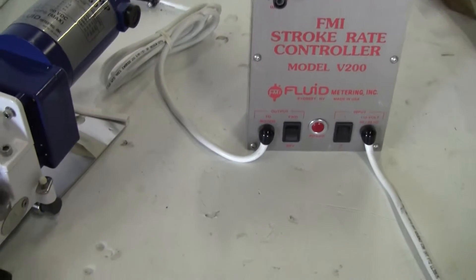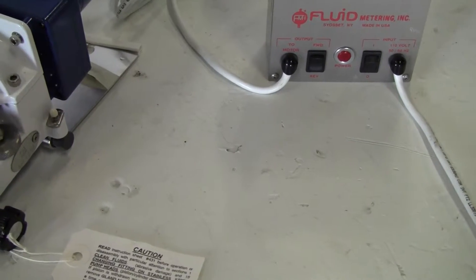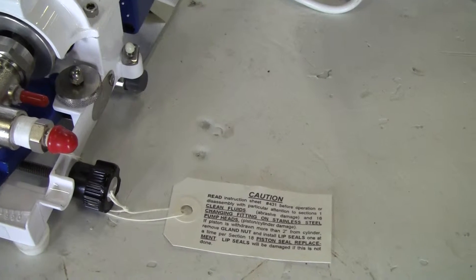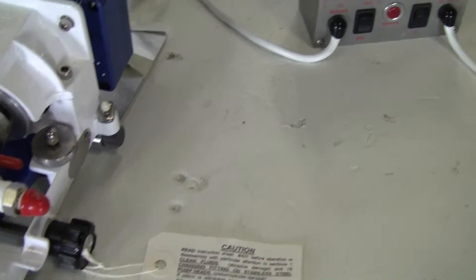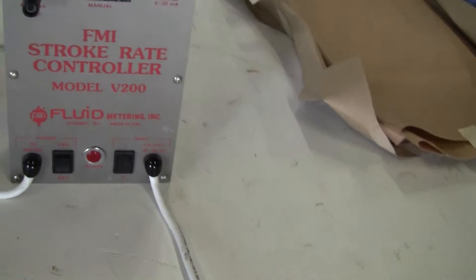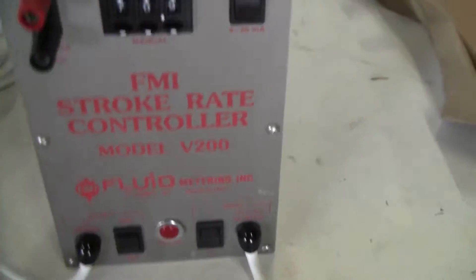It's a brand new pump. It's got a QC-SC-W gland pump head, a 1¼ inch ceramic piston. You can get various stroke rates, ¼ inch NPT female ports, and it's controlled by a FMI stroke rate controller model V200.